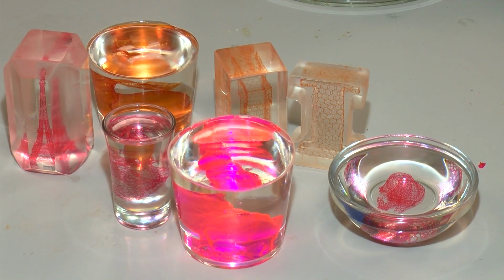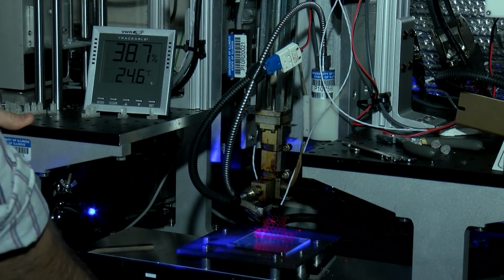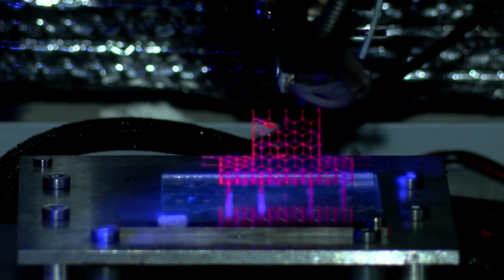replica of body tissue. We're trying to reproduce structures that we see in our body, and there are no rectangular cross sections in our body. Everything is circular. Our blood vessels, all the ducts in our body, our airways, they're circular. That's why he says this truly 3D approach to 3D printing is crucial, and this could be a medical breakthrough.